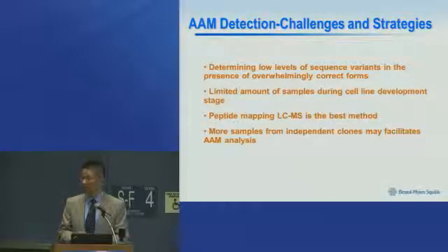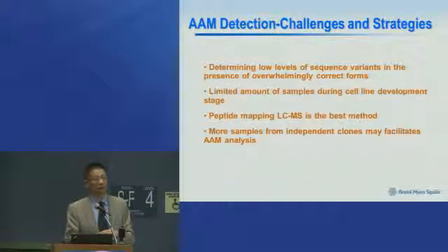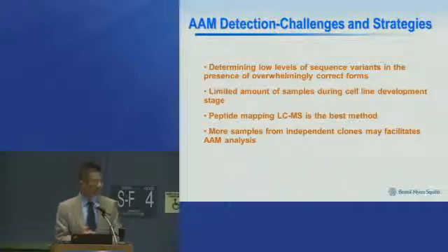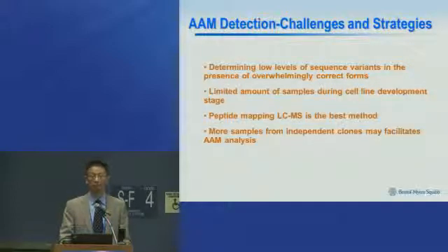Most of the time, this happens in the cell line development stage. You need to tell the cell line people, this is homogeneous, or this is not homogeneous. It is not always that easy. But we do have certain tricks to provide critical information for cell line development. For example, oftentimes we think less sample is easier to have a quicker turnaround if you have fewer samples.